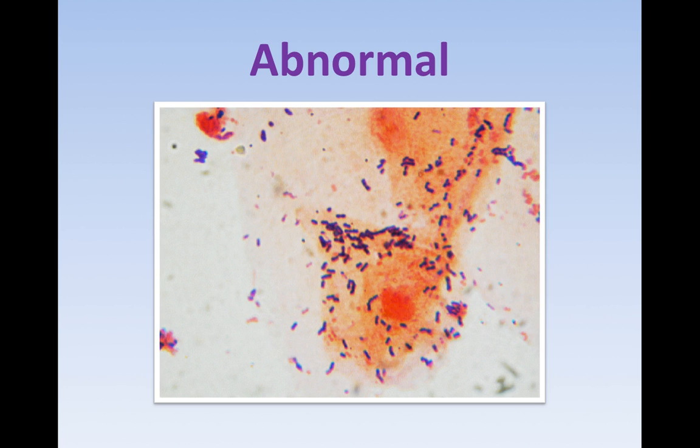This one, on the other hand, is very abnormal. Here we have a keratinocyte that is being swarmed by bacteria — the keratinocyte is full of bacteria. This is an abnormal ear swab, one that definitely would need some treatment pending the vet's approval and diagnosis. Lots of bacteria.